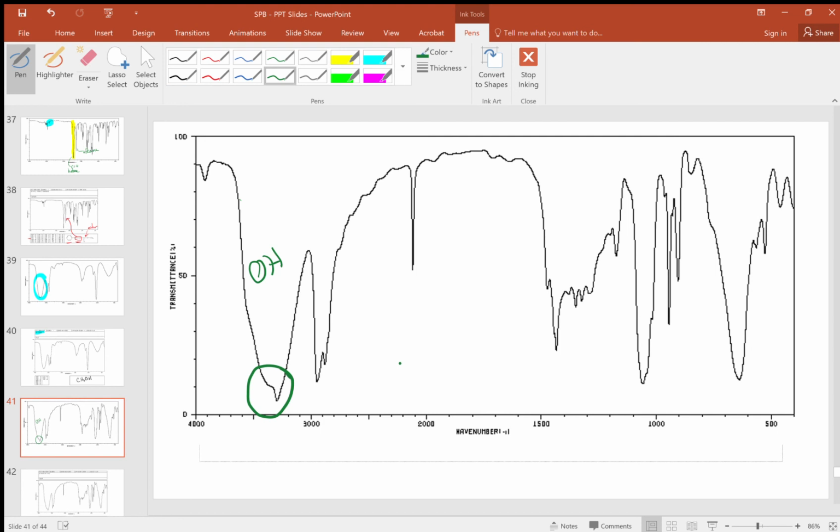Normally, and I know we haven't seen a lot of spectra at this point, but normally the bottom of an alcohol peak is fairly straightforward like that. And this one's kind of pointed like that. We also see an alkyne here. So those are the two major functional groups that we see. We have an alkyne, we have an alcohol.